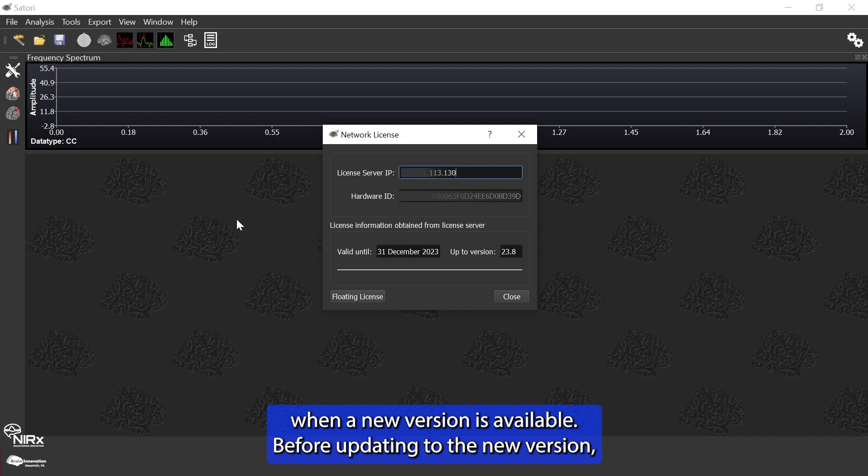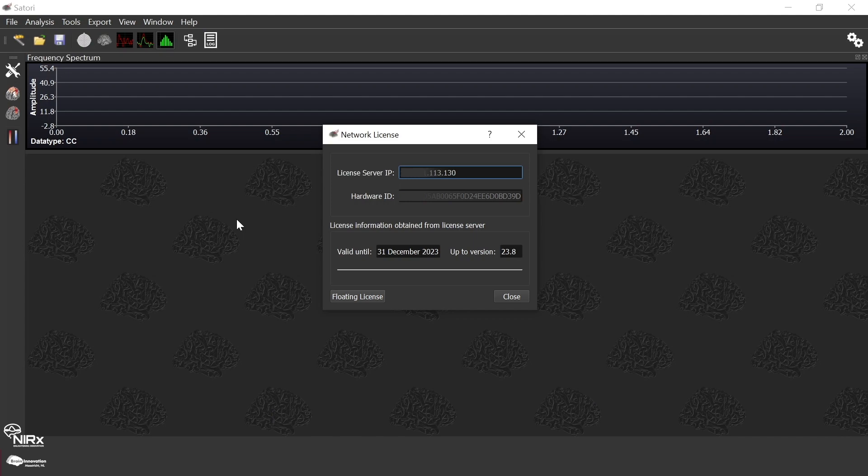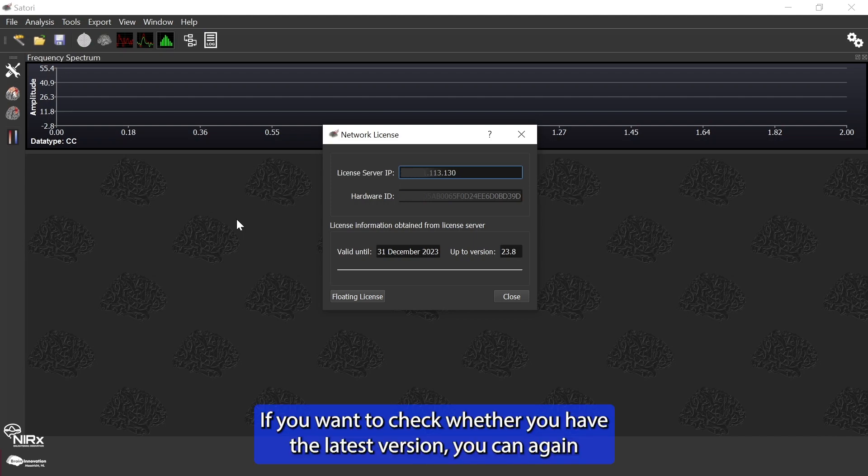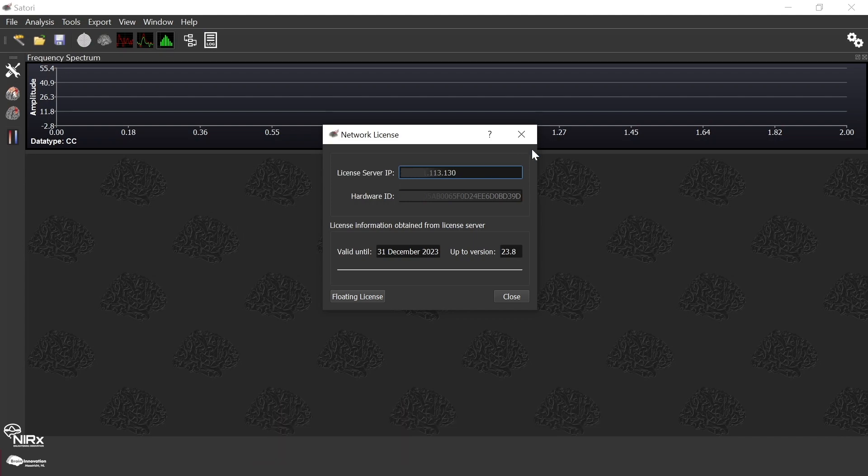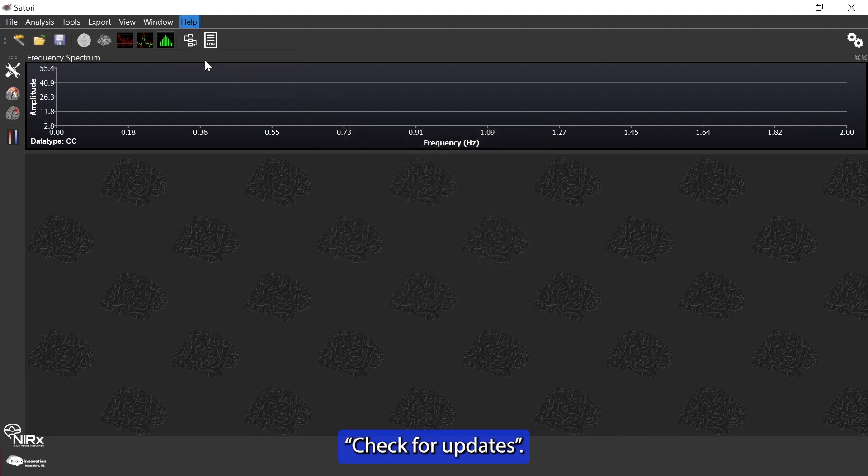Before updating to the new version, you can check the release notes mentioned in the pop-up window. If you want to check whether you have the latest version, you can go to the help menu tab and click on check for updates.